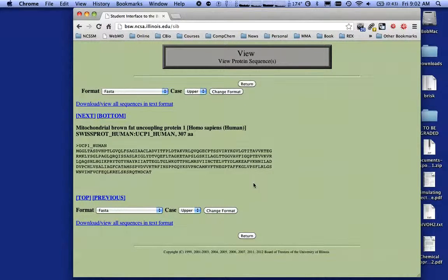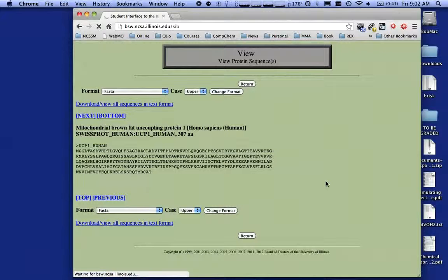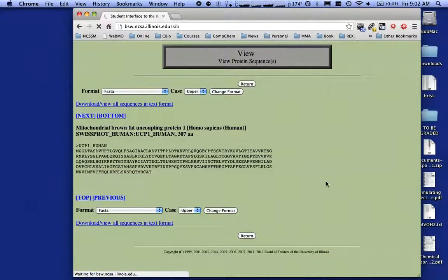When you want to go back to the previous menu, don't hit the back button — use the Return button. That way you won't lose your session. If you hit the back button, it's possible you could get kicked out of Biology Workbench. So make sure you use the Return buttons. We're waiting for the server — it's a little busy this morning, either the server is busy or the network is slow here at school, or both.